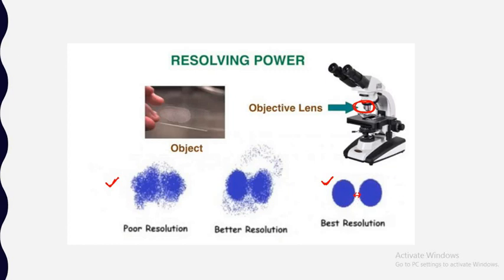Now whenever you are choosing a microscope for the study of cellular activity, resolution is taken into consideration, because resolution will lead us to the fine detailing. Fine detailing can be known. So resolution is important whenever you are choosing a microscope.